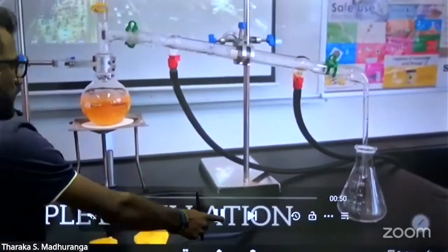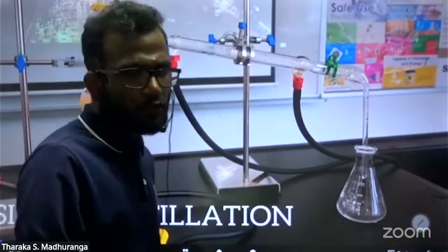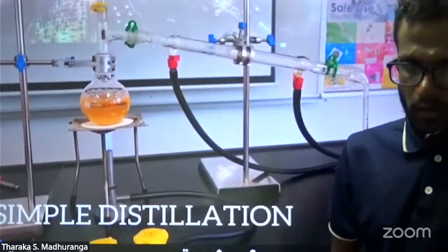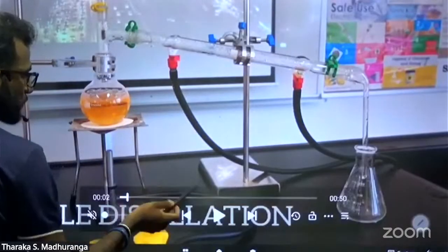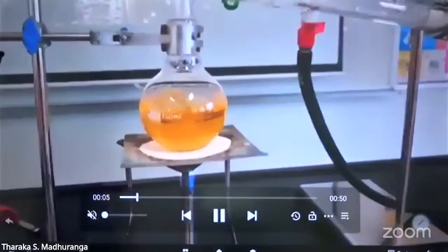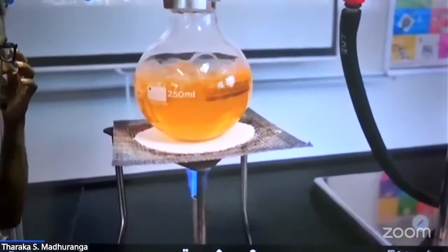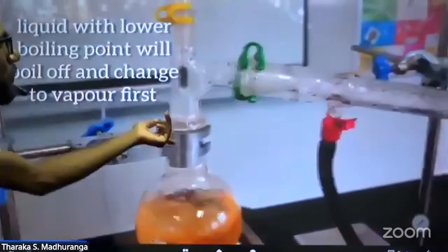Okay, you can see they're not going to use a heater. That's a Bunsen burner. A Bunsen burner you can also use if you don't have a heater. If you don't have a heater, we can use a Bunsen burner for the heating process. Then the solvent is heated and boiling, and after that they are vaporized.